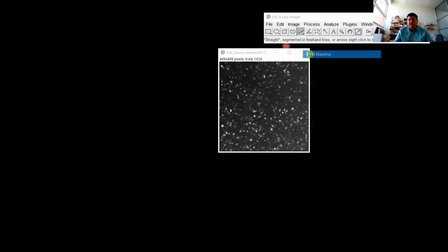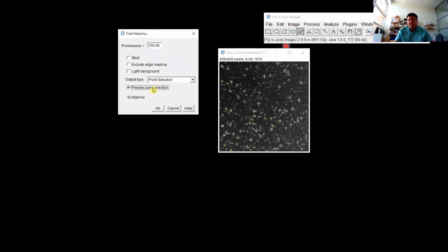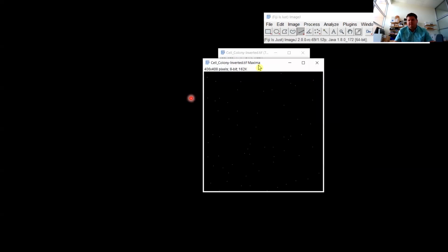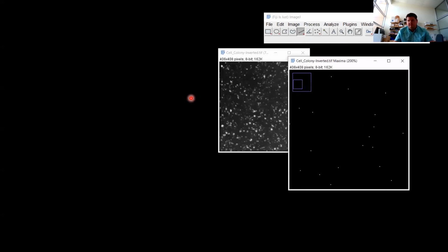And so if we do that, Find Maxima, preview it, yes, I can output a single point. And then I get this image with single points.